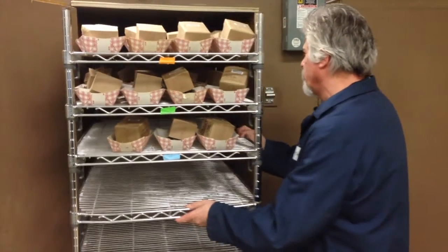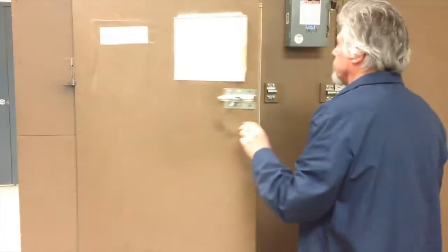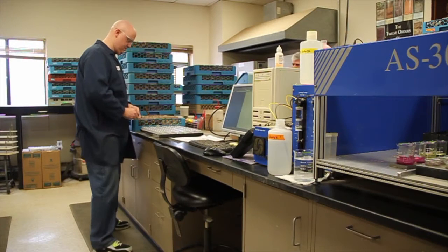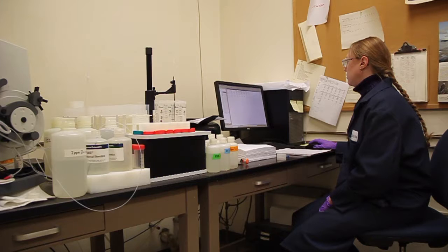Back in the lab, the AgriOne lab staff put the soil samples into a drying oven at 50 degrees Celsius. Once dried, the samples are ground and run through a robotic tester for pH. Another round of weighing and high-temperature burning allows for organic matter content analysis.